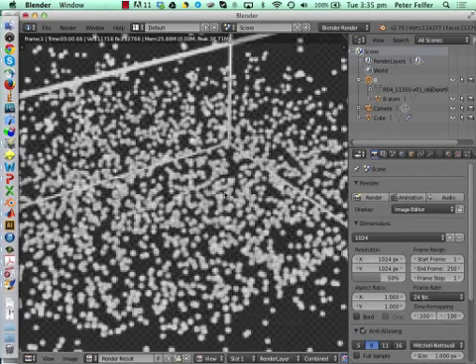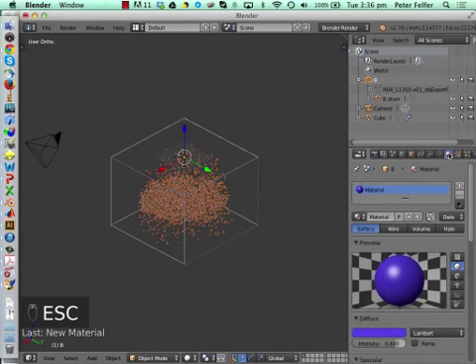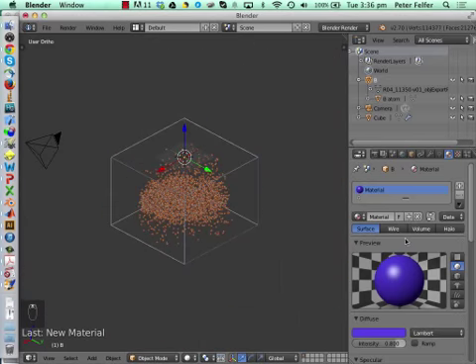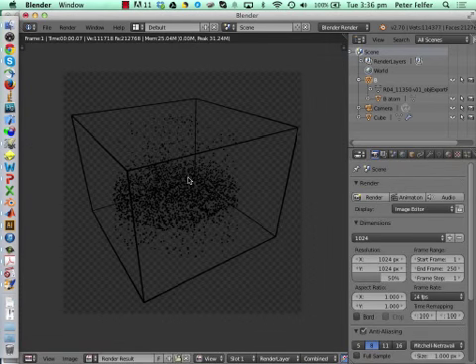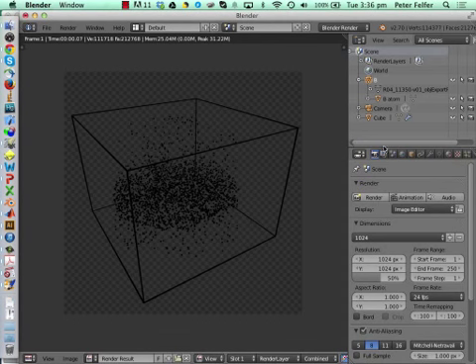So now you can see that the boron doesn't have a color. Why does the boron not have a color? It should have a color. That's a bit odd. Because it's too bright, it's all white. Because we've got the ambient occlusion still going here. Sorry, my bad. And now it's all black because we don't have any color. But as we said before, we're going to be mostly working without lighting. So just click Shadeless, and then go and render it out.